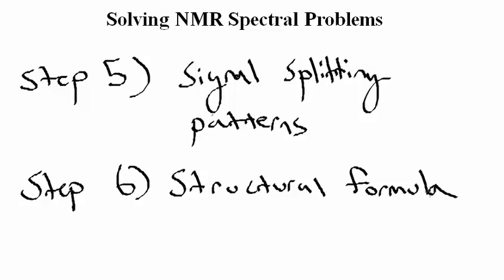So what you're basically going to get at this point are a couple of different pieces of your molecule, and you basically just have to try to put them together like a puzzle.